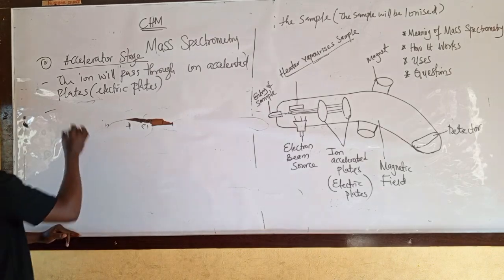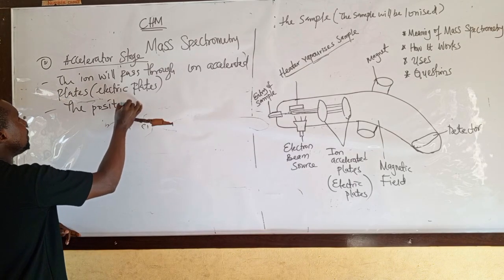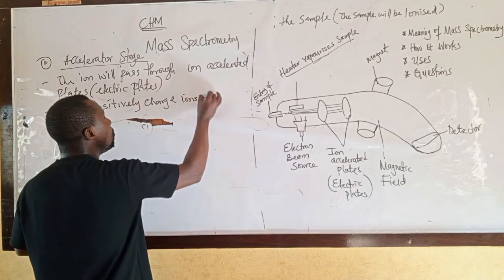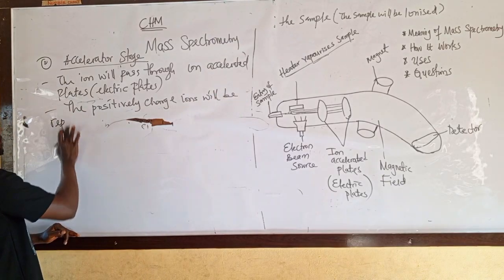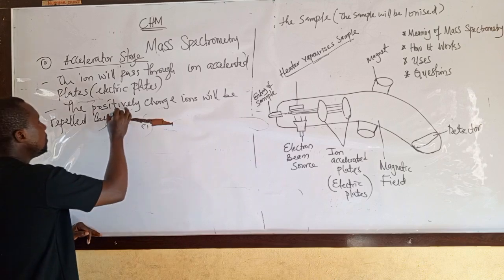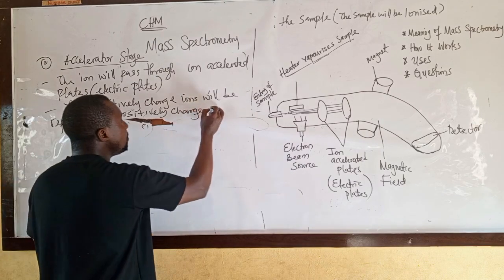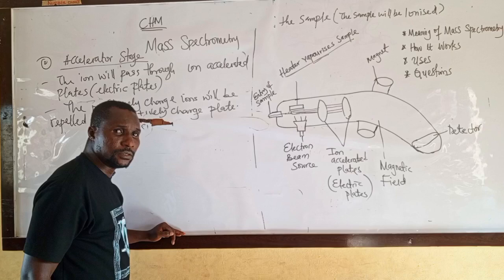Another thing: the positively charged ions will be repelled by the positively charged plate.